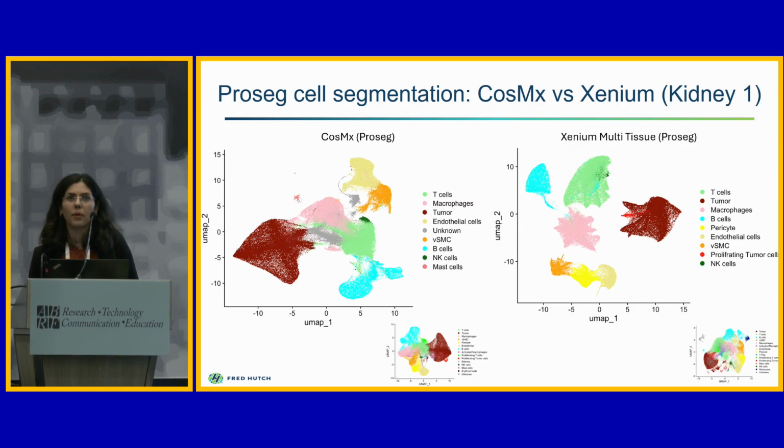So, I believe it's going to be the issue with everything. Even if you run something like MERFISH, you always have RNA leakage outside. So you only look at the RNA in the perimeter of your cell, and then look at those cells. That's the way that we looked at it.